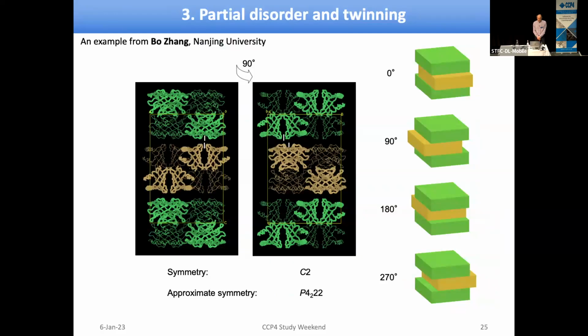In example 3, we have fourfold ambiguity of packing. In contrast with previous examples, the contacting layers are not related by pure translation, but by rotation 90-degree and translation. Packing ambiguity occurs because of a little offset shown by white marks in there. And the offset can be along X or Y, and positive and negative, resulting in 4 twin domains, schematically shown on the right. Note that intermolecular contacts here are very weak.